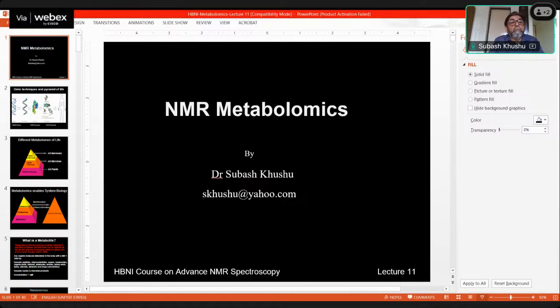Then universality of metabolite detection. In NMR, if a metabolite has hydrogen or other NMR-sensitive nuclei, then you can detect these nuclei, and sometimes because of the proteins and macromolecules, there could be line broadening, which can affect your results. However, MS is quite a bit better in that way, but in MS you need to first separate all components and then quantify them. So it's a little tricky.